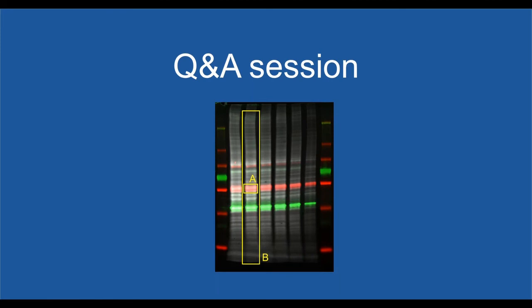Okay, right. So let me see, do we have any more questions? Okay, I think that we do not have any question anymore. I think that's from Bun Giat Ma. Do you see the questions? Hang on, let me scroll up. Yes, the first question being asked: may I know, do all Azure systems come with fluorescence detection capability?